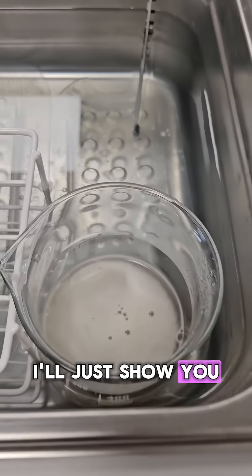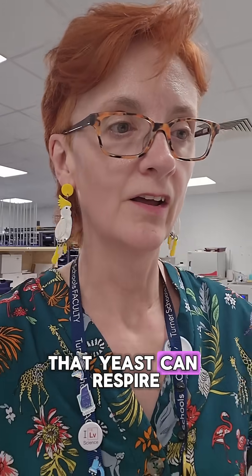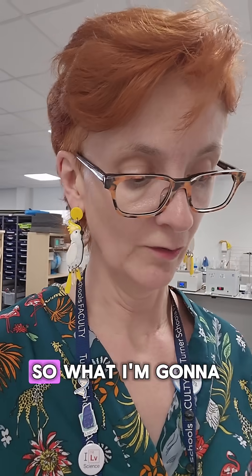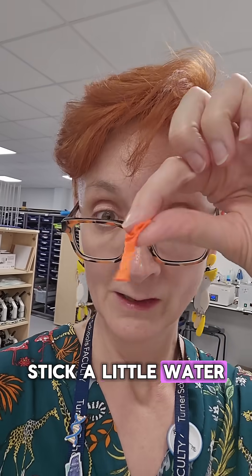I'll just show you — got the yeast there bubbling away. The point of this practical is to show that yeast can respire anaerobically, so without oxygen. What I'm going to do is put them in these little bottles, fill them up so there's no air, and stick a little water balloon over the top.